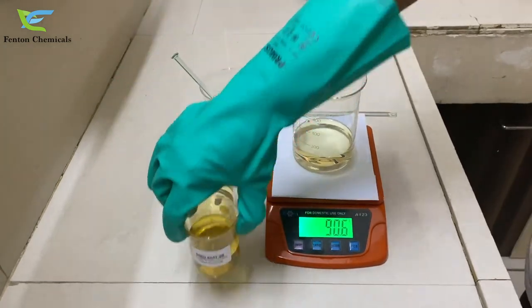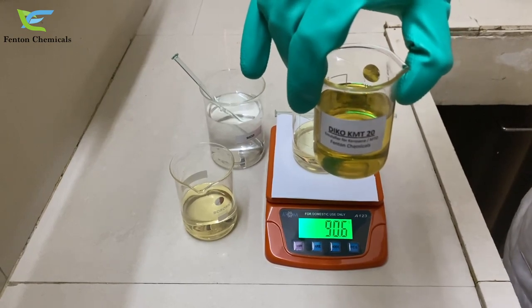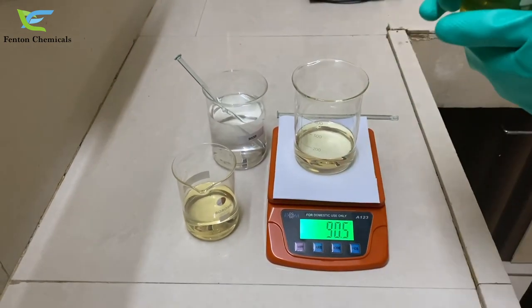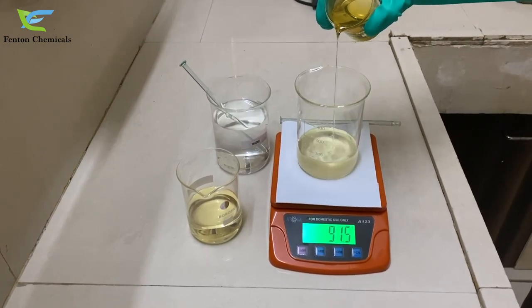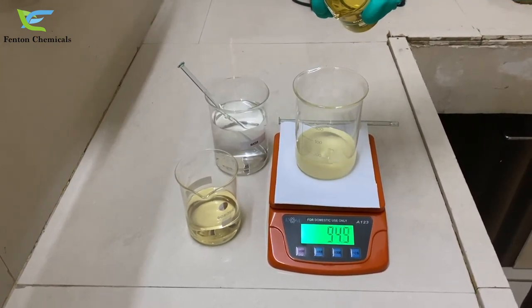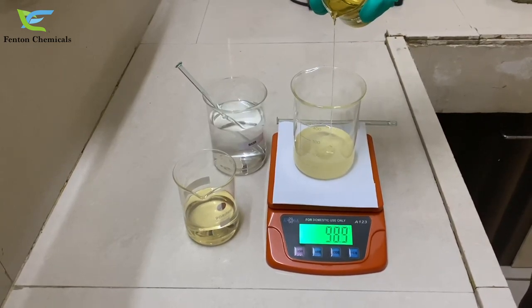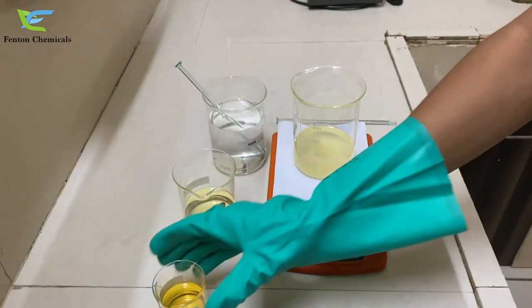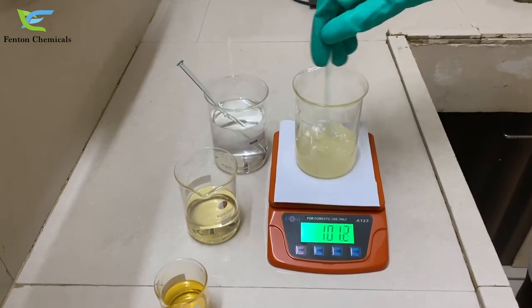Now we will add 10% of our emulsifier Deco KMT20 to it, so we will be adding 10 grams. Now we will mix to get a homogeneous solution.